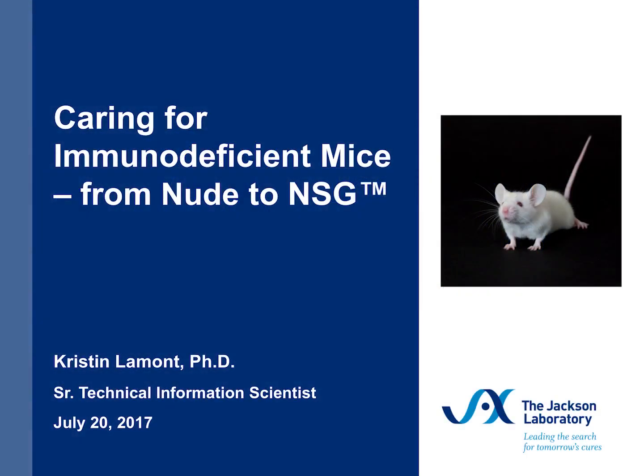I will be talking about some of the best practices if you're going to be working with immunodeficient mice to maintain their health status. So whether you're simply just breeding them or if you're actually going to be using them in experiments. My goal is to share with you some of the considerations that we take into account when working with these mice and give you a toolbox to use if you're going to be working with them on your own. And this is especially with regard to the development of highly immunodeficient mice.